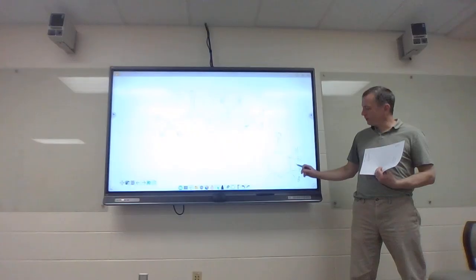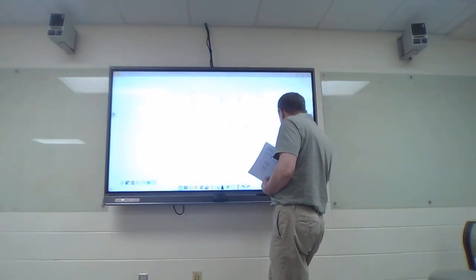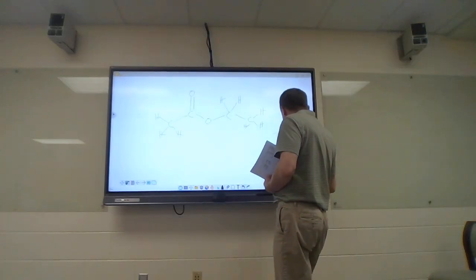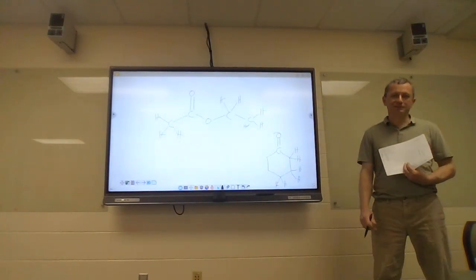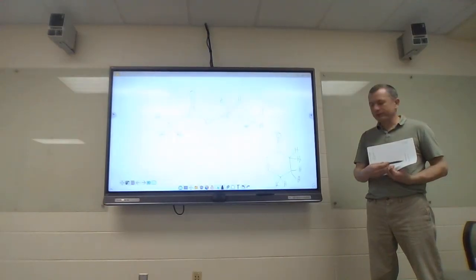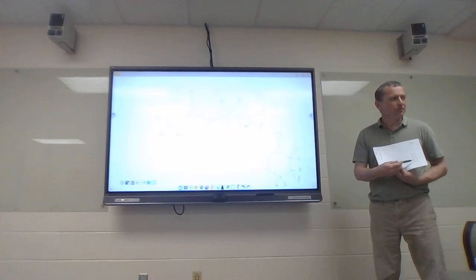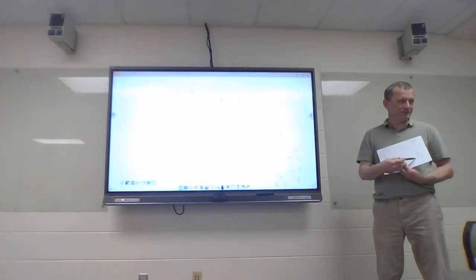And now you say, oh, it's neighboring. Nah. That's when it's a no. You can look at that peak, and if you can pick out 4 plus 1, 5 peaks out of this, God bless you. I don't see it.